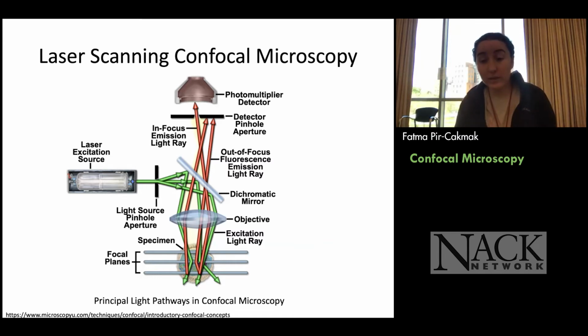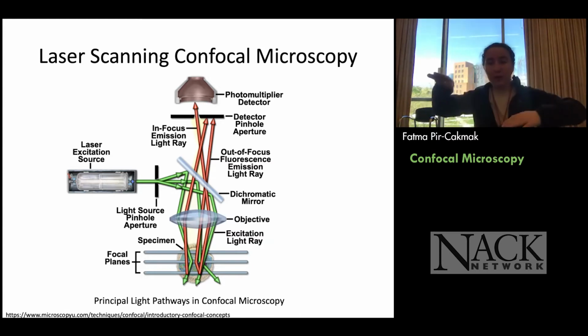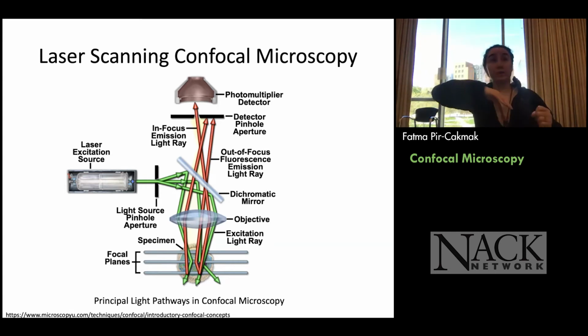And this is what's going to happen: you cannot differentiate between the slices or layers of the sample you have. Because think about a cell. A cell is not just one slice, right? You have all these heterogeneous systems distributed all over the cell. Think about the thickness of the cell, right? You will have different properties across all this thickness.